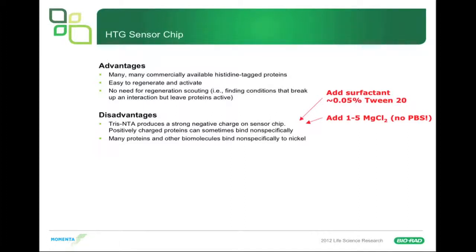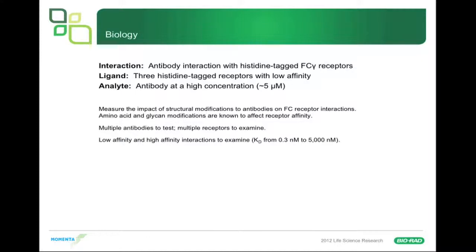We found a way to work around the nickel nonspecific binding problem. The interaction we were studying was antibody interactions with His-tagged Fc gamma receptors, which are commercially available. We had three histidine-tagged receptors with low affinity to the ligand being measured, and the analyte — an antibody — was typically at high concentration, around 5 micromolar going lower. When you have things in the micromolar range, you can often run into nonspecific binding. We wanted to measure the impacts of structural modifications on antibody-Fc receptor interactions, with KDs ranging from 0.3 nanomolar to nearly 5 micromolar — quite a range to work with. It's a perfect application for the ProteOn since you can test multiple interactions at once.